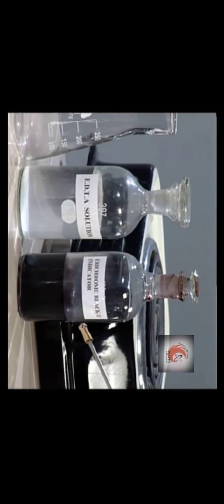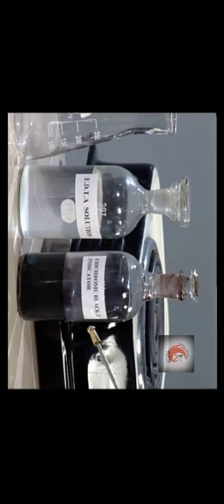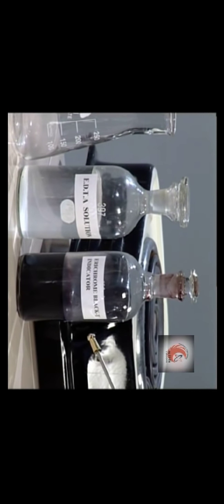To prepare Eriochrome black T indicator, you take 0.4 gram of Eriochrome black T powder and 4.5 gram of hydroxylamine hydrochloride in 100 ml of 95% ethanol.